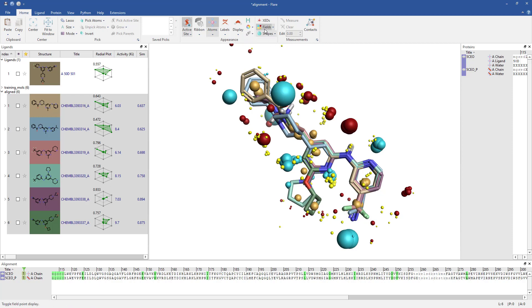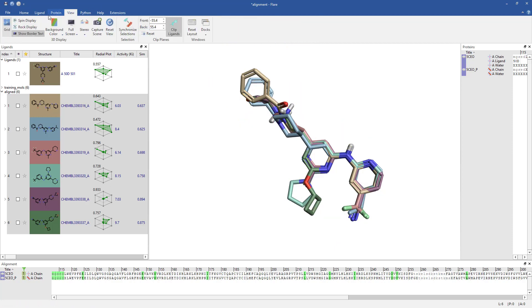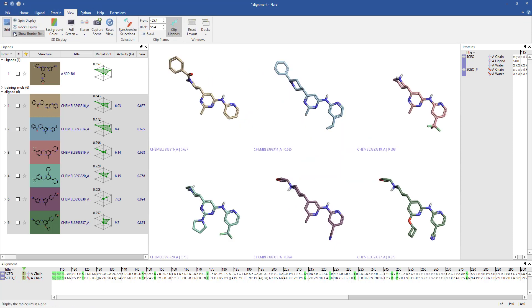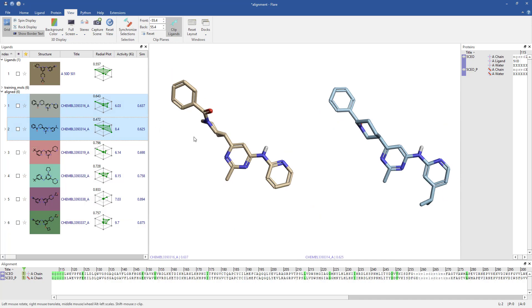If I switch to grid mode, I can compare the aligned molecules and their activities to establish which features might be contributing to activity. If I compare molecule 1 with molecule 2, it's clear that substituting the pyridine with an isopropyl increases the activity.